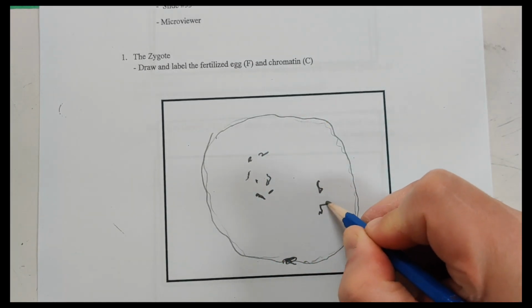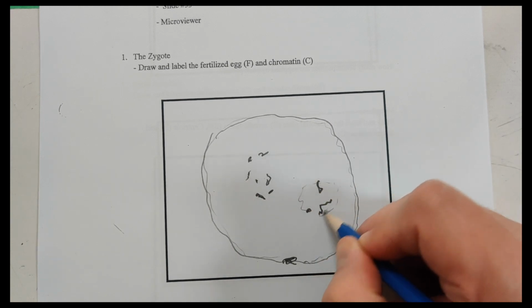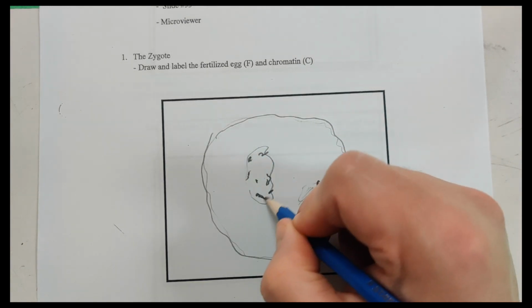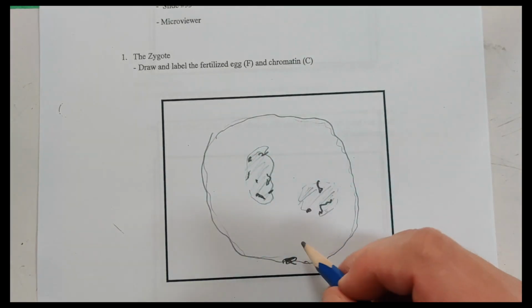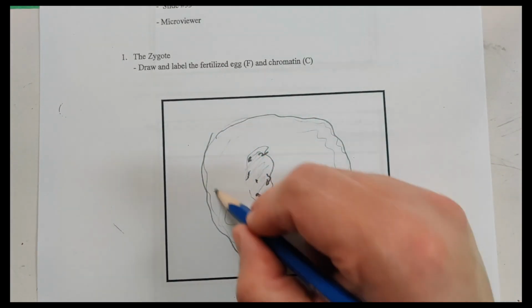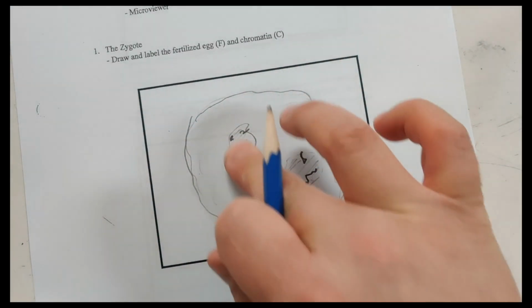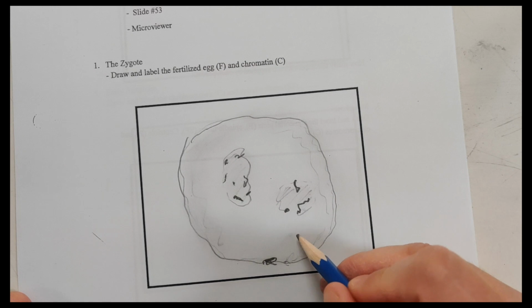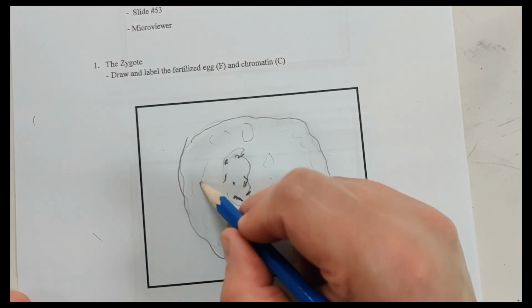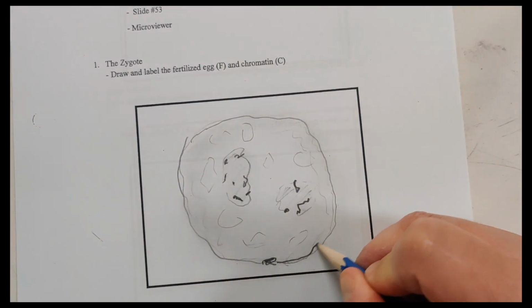So a little bit of detail, right? I want to make them kind of accurate. This whole area around it is a little bit darker. This area here is a little bit darker too. Then there's slight edging. You might want to shade that in a bit and smudge it around the edges. Something like that, right? And then there's kind of air pockets, it looks like. Now these are probably vacuoles. So I would say that's an acceptable drawing, right?